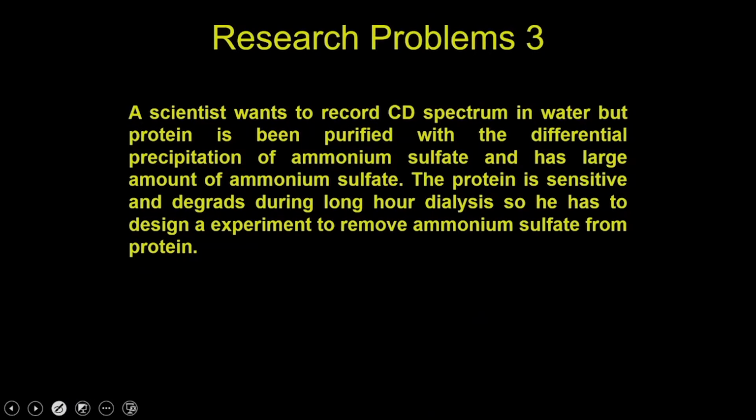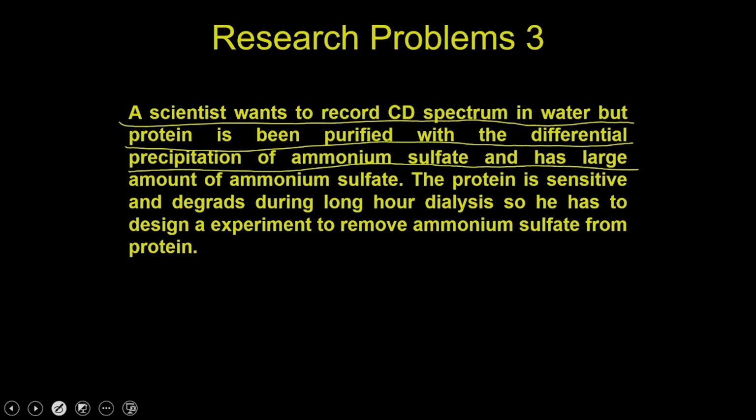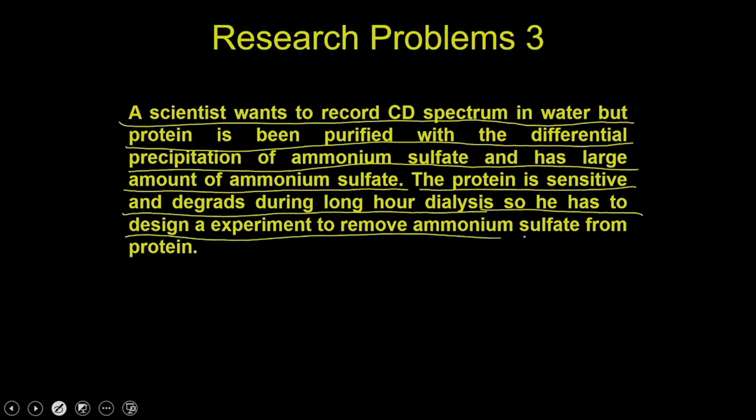The next experiment, or the third problem, is that the scientist wants to record a CD spectra in water, but the protein is being purified with the differential precipitation of ammonium sulphate and has a large amount of ammonium sulphate. The protein is sensitive and degrades during long hours of dialysis. So, he has to design an experiment to remove the ammonium sulphate from the protein.